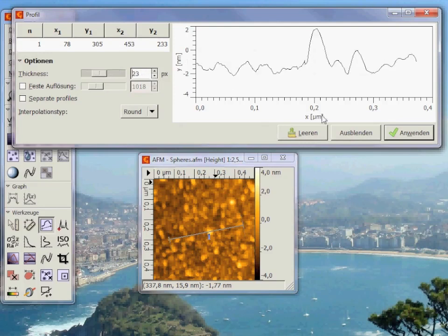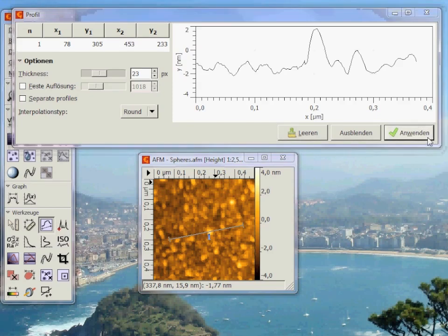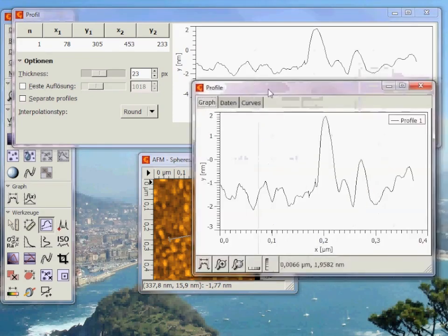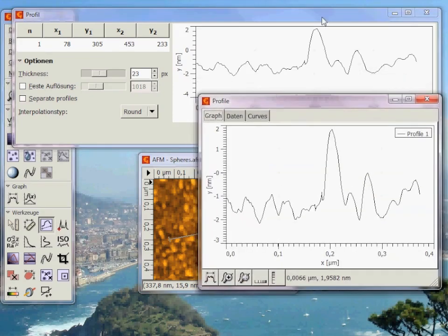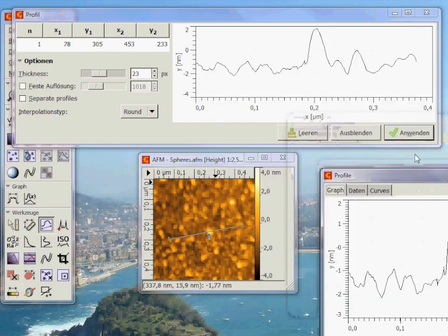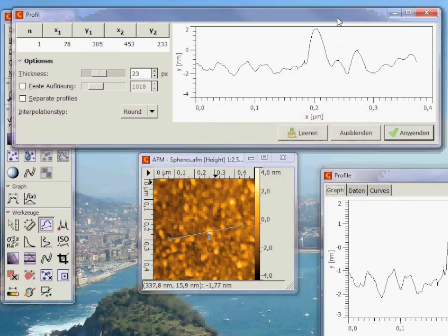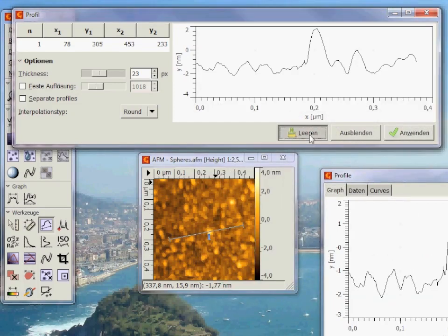After you click execute you get a little window with your extracted profile. Now you can empty the line and close this window.